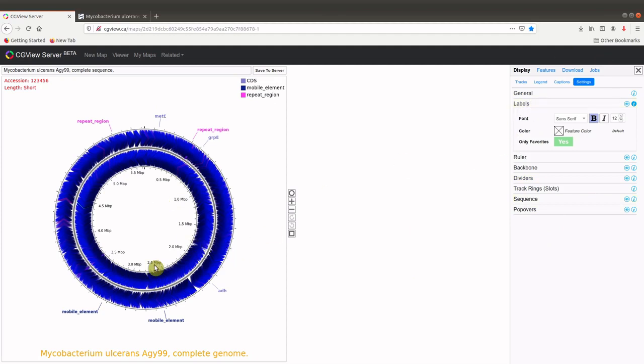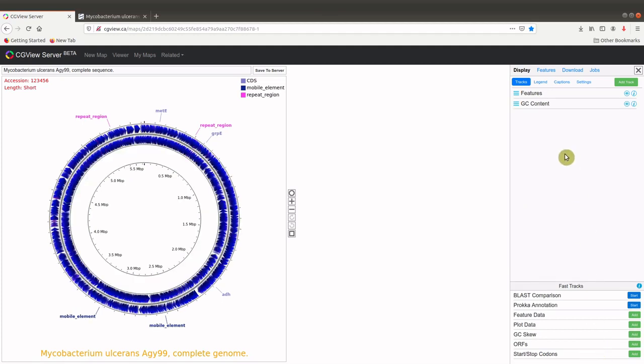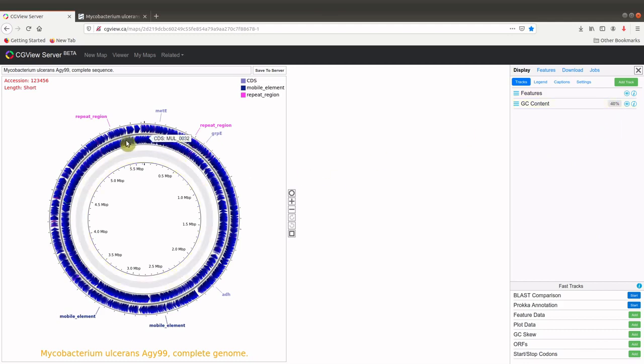We also want to add some additional information, GC contents. So those are tracks. So we have some tracks here we can add. We'll add the GC contents. So we click on GC contents and then we wait for it to be added. Notice that there's a number here that is increased. That's a percentage in terms of where this particular compilation has reached. So you just wait while it gets populated into your map.